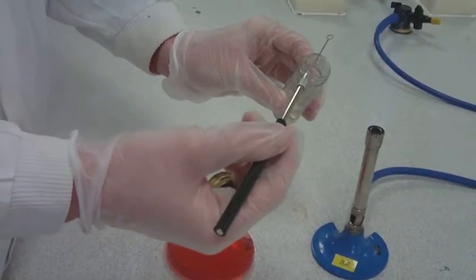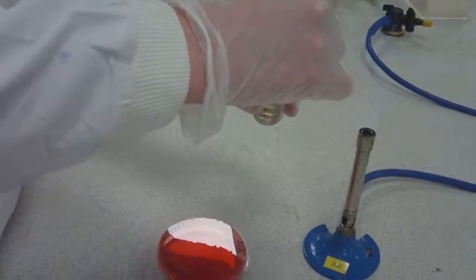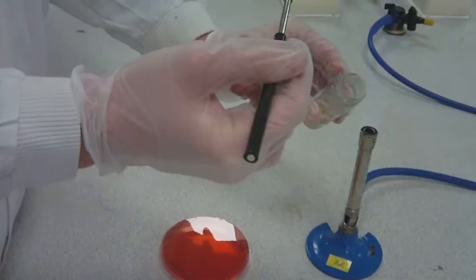Once the bottle is sterile, put the loop into the suspension without touching the sides of the bottle. Remove the loop and then re-flame the neck of the bottle before closing the lid to sterilize.